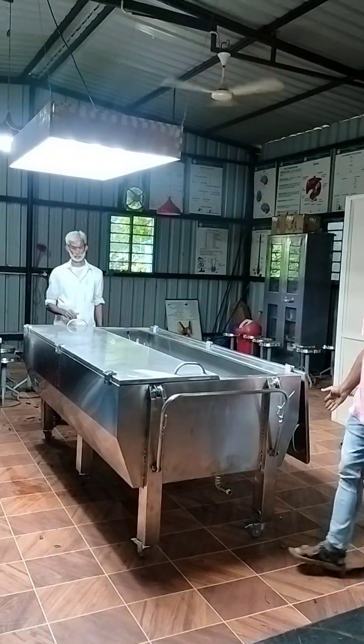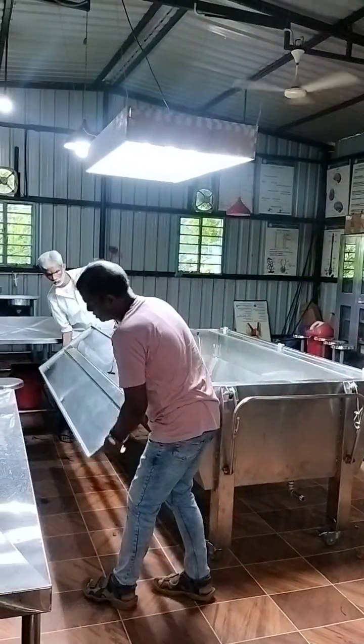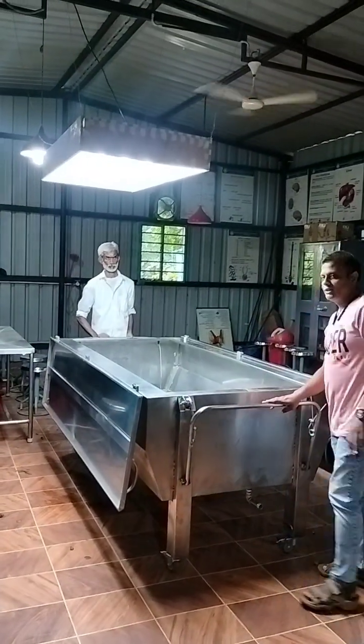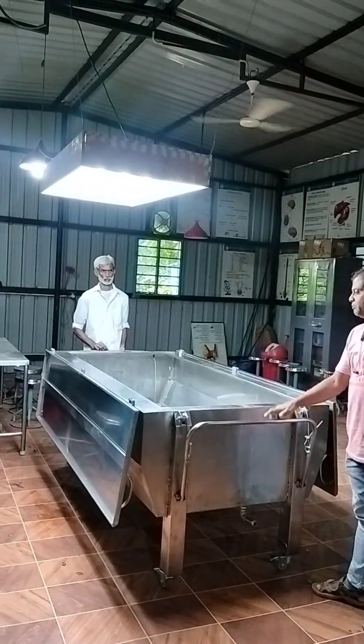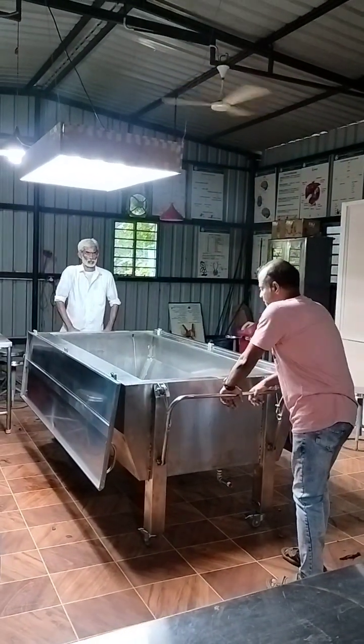It will completely collapse perpendicular to the ground so that it ensures zero obstruction to the students standing around. And then this is the driver for lifting the body. When you move it down and knock it, the body will come out.